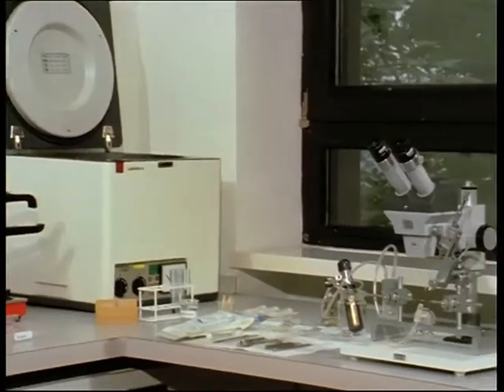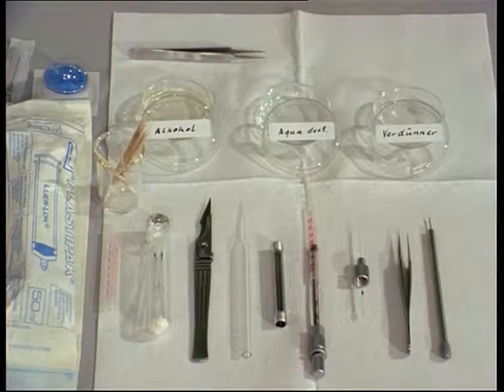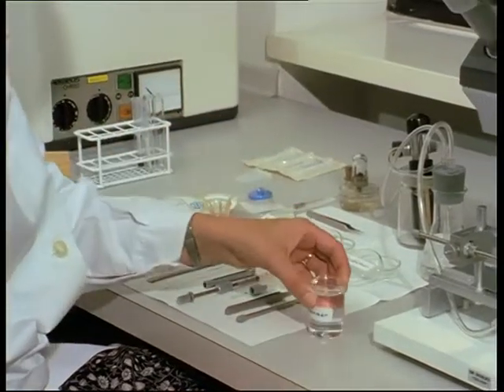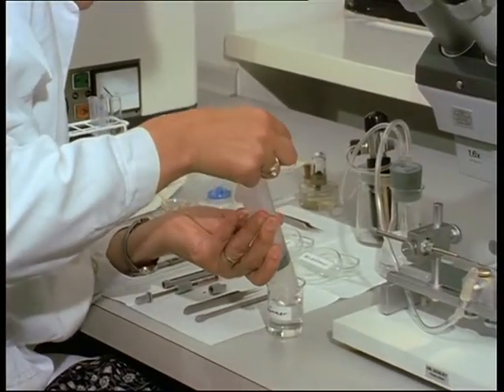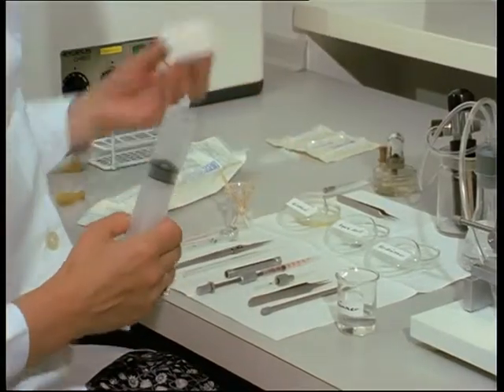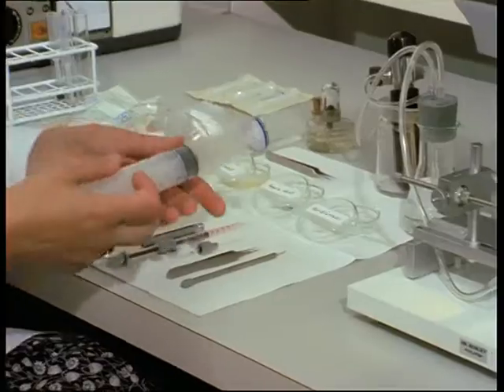Hygiene is essential in the insemination laboratory. All glass and metallic instruments are autoclaved daily. In preparation for semen collection, a semen diluent — for example saline solution or, as here, Tris buffer — is drawn up. The liquid is sterilised by micro-filtration. The pore diameter of the membrane is 0.2 microns.